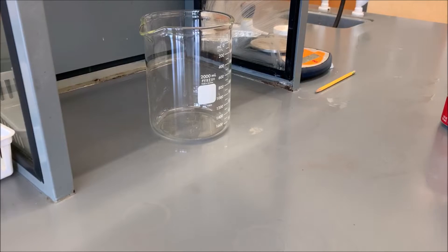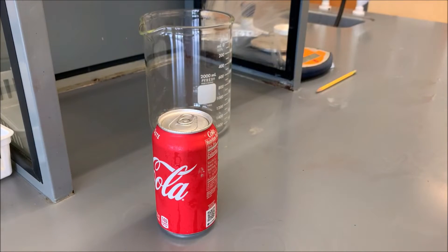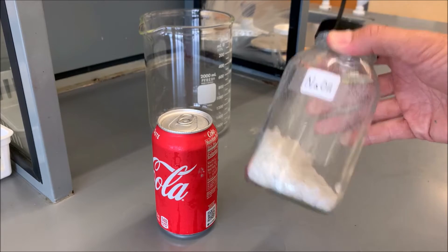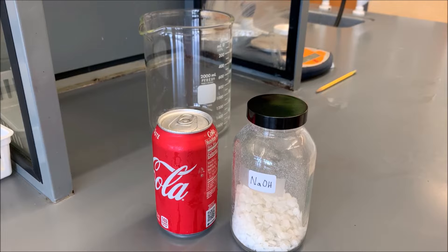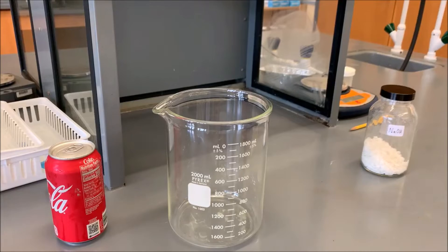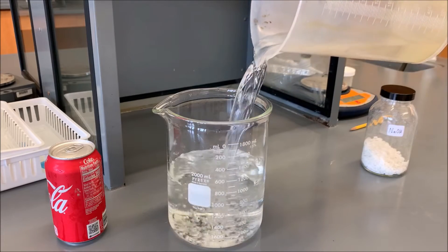For our experiment, we're going to use a can of full Coca-Cola, and to remove the aluminum exterior, some sodium hydroxide. Sodium hydroxide will react with aluminum and dissolve it away into an aqueous solution. We're going to start by making the sodium hydroxide solution, which is just made by using water and solid pellets of sodium hydroxide.